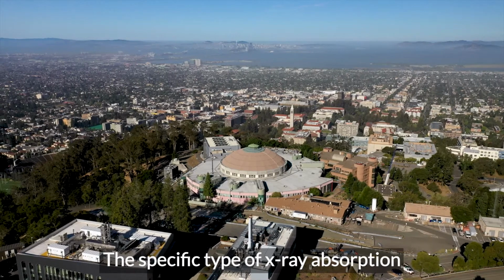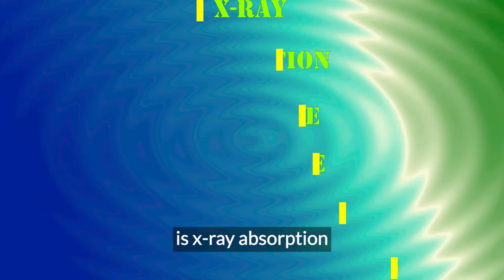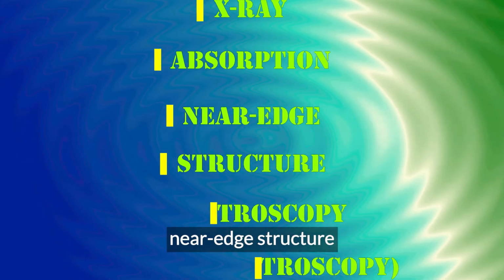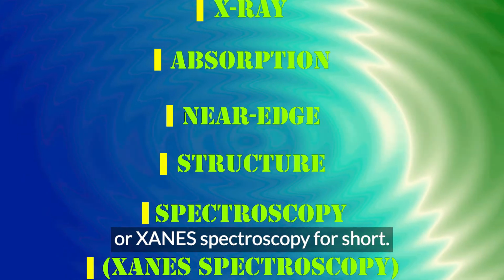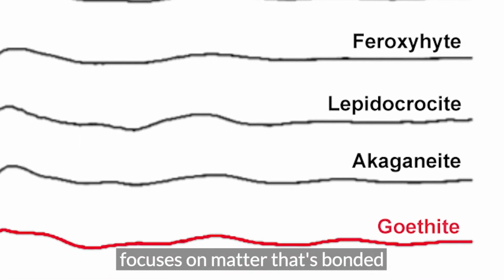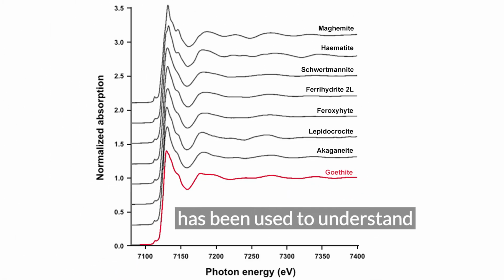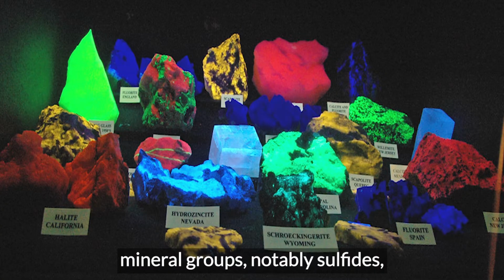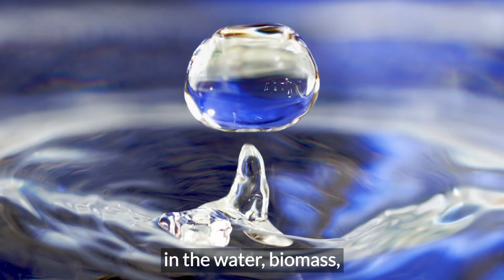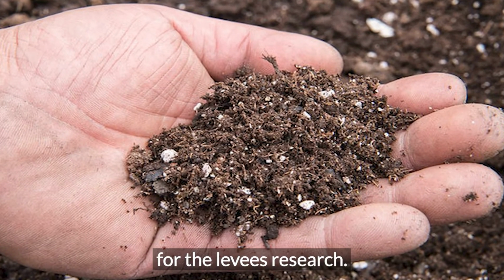The specific type of X-ray absorption spectroscopy used in this research is X-ray absorption near edge structure spectroscopy, or XANES spectroscopy for short. XANES spectroscopy specifically focuses on matter that's bonded to the surface of other matter. This type of spectroscopy has been used to understand the distribution of mineral groups, notably sulfides, in the water, biomass, and soil samples taken over 2 years for the levees research.